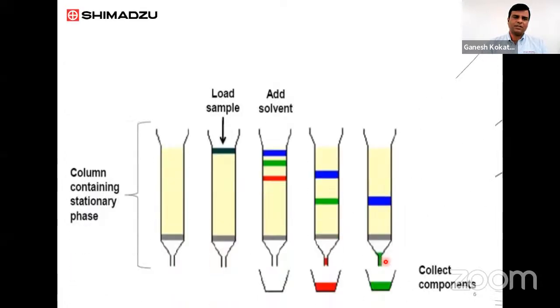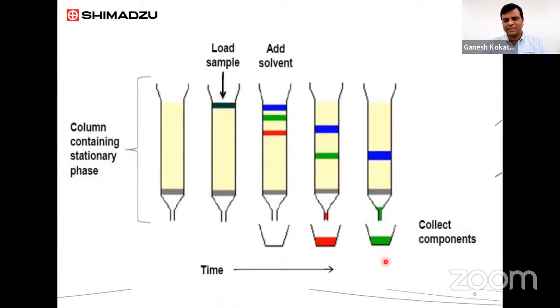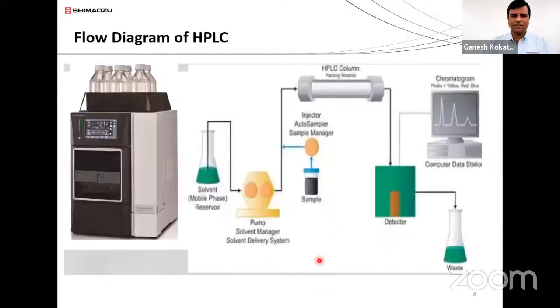So what is it all about? Obviously this slide is not for you, because you know very well how to load the stationary phase and how to load the sample. Depending on the Rf value, the sample gets fractionated, and each fraction is separated into different components depending on your Rf value and your time. This concept is used in HPLC itself, with the reservoir bottles, the detectors and everything. So those kinds of analysis are possible with this technique.